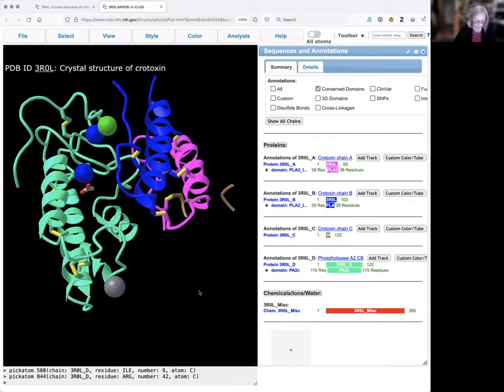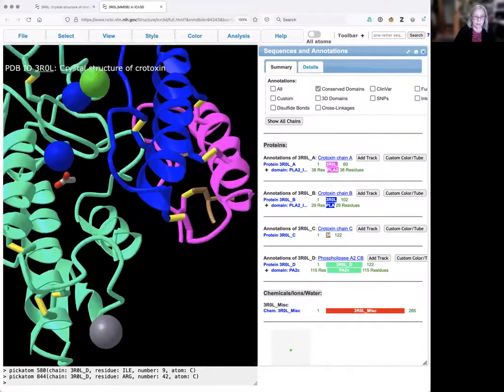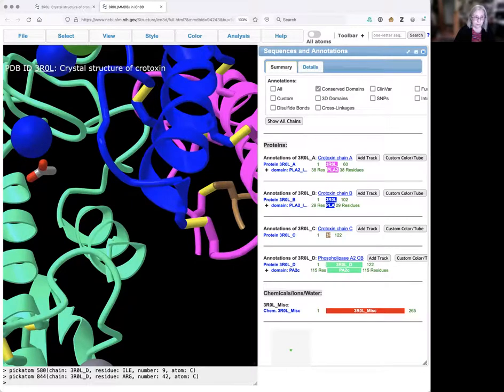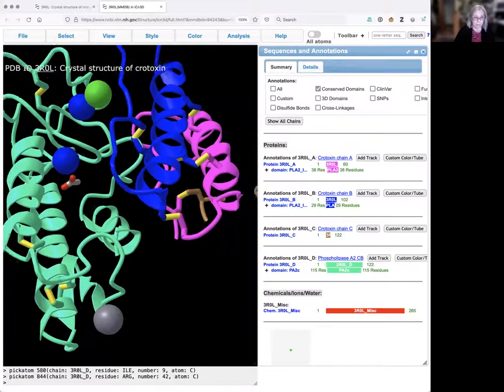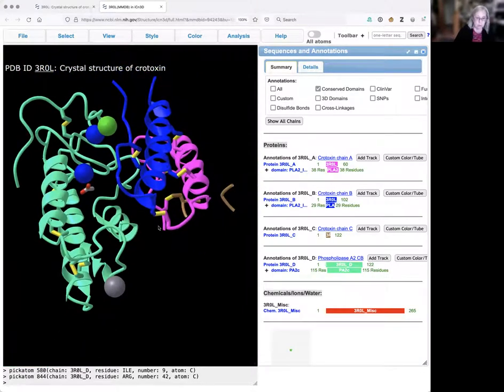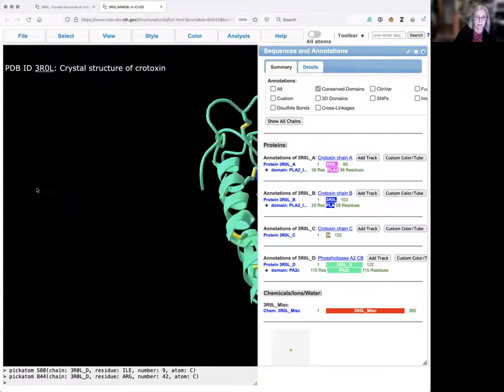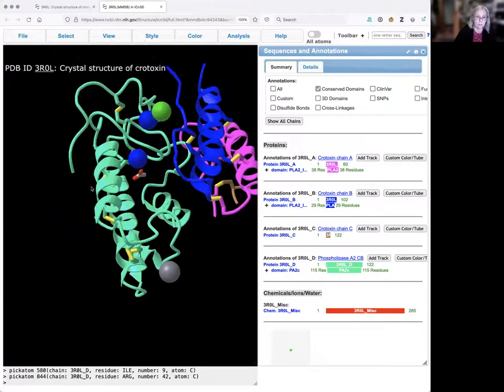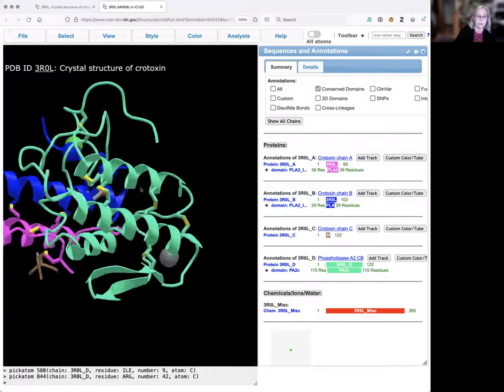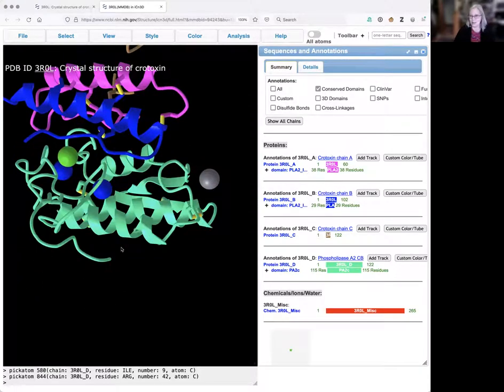So those are the basic manipulations. We can zoom in, we can zoom out. We can hold the control key down and drag. Or we can grab the structure and we can turn it. It's all for now.